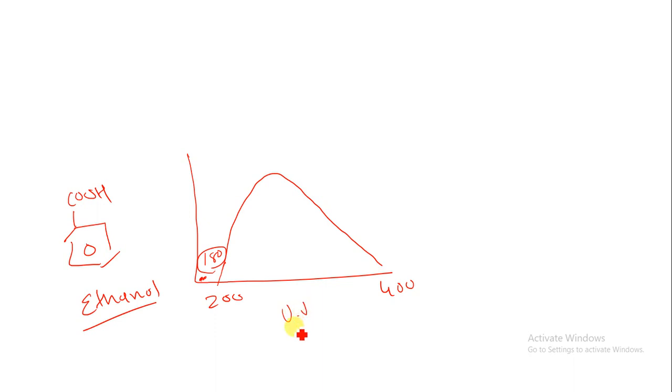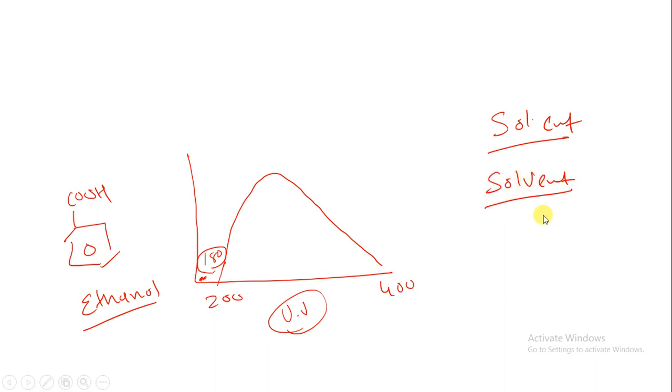So that is why we have to take care that whatever solvent we are using should not interfere in any region of the sample.